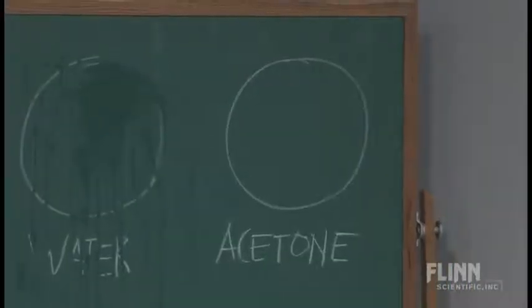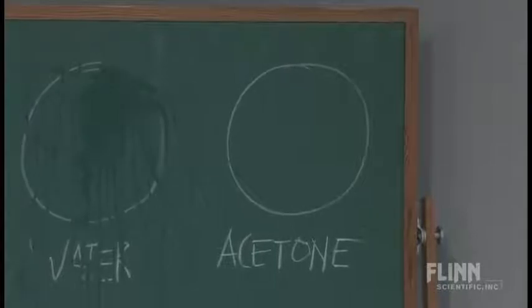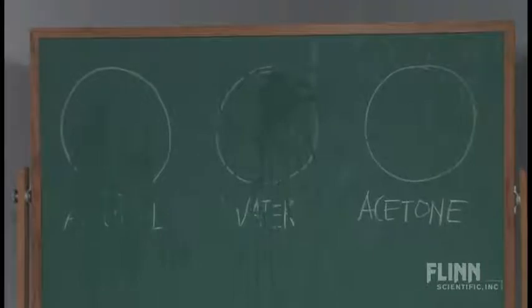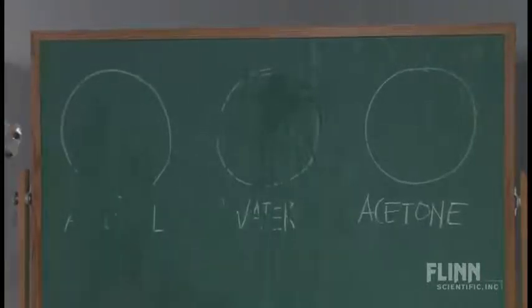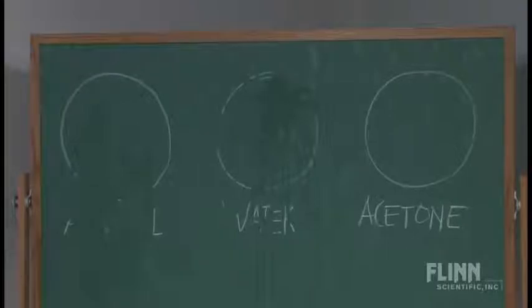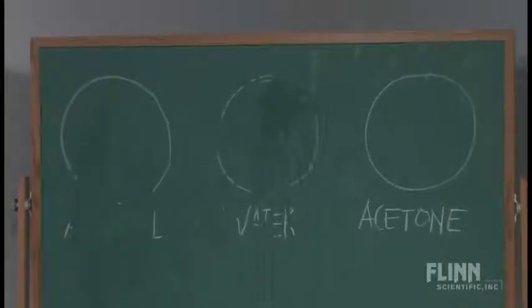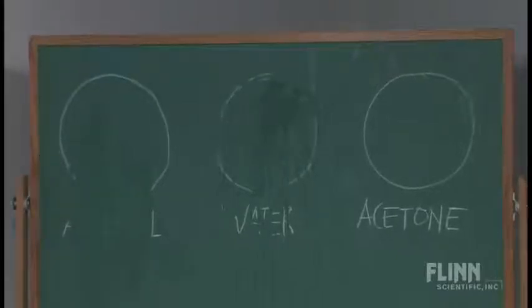I've probably done this thing 400 or 500 times, and with the exception of a little bit of liquid over here on the wall, I don't really see much anywhere else other than the wall and a touch on the floor there, which is really nicely done. I mean, a lot of times it's on the back wall and various other things, but already I think you can see some things that are going on.